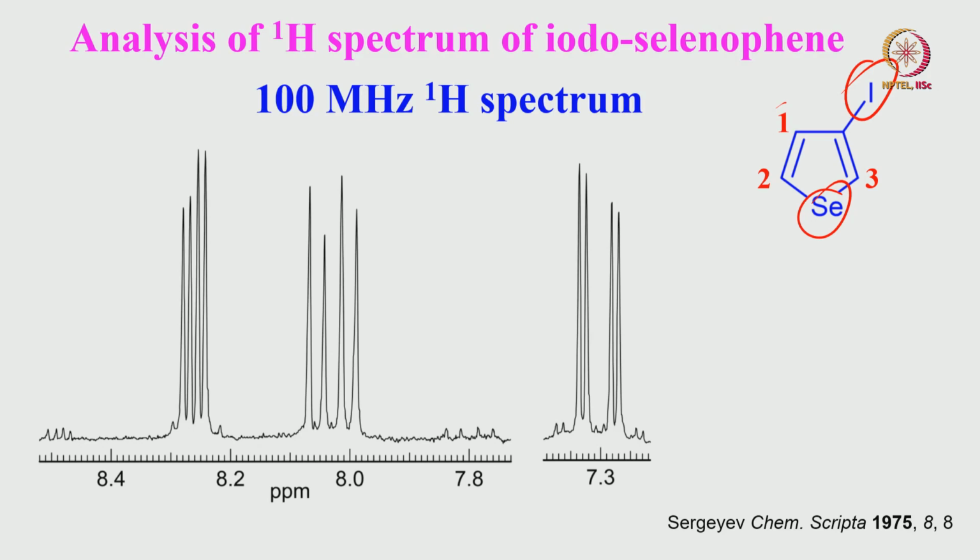First you have to make the assignment for the proton peaks. I make the assignment for the proton peaks as 1, 2 and 3 by using the splitting idea of my splitting pattern, which I already discussed several times. This is proton 1, which has a large ortho coupling, then meta coupling. Then for 2, both couplings are nearly equal, and 3 has both very weak couplings. Based on the separation of the multiplicity pattern of the coupled spins, I would say this is proton 3, this is proton 2 and proton 1. That assignment is good.